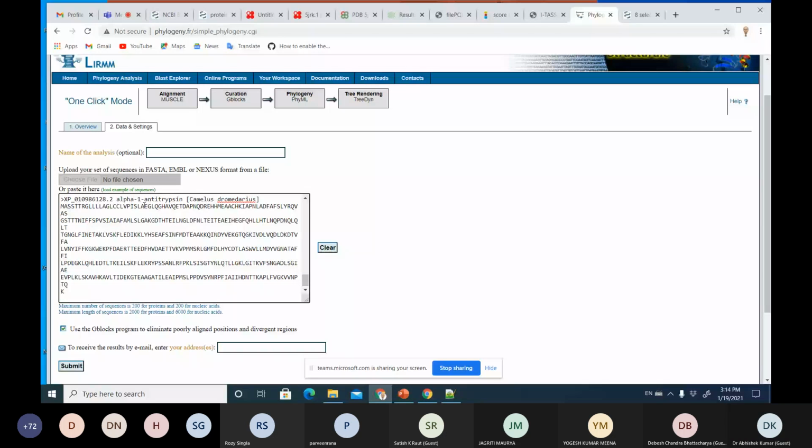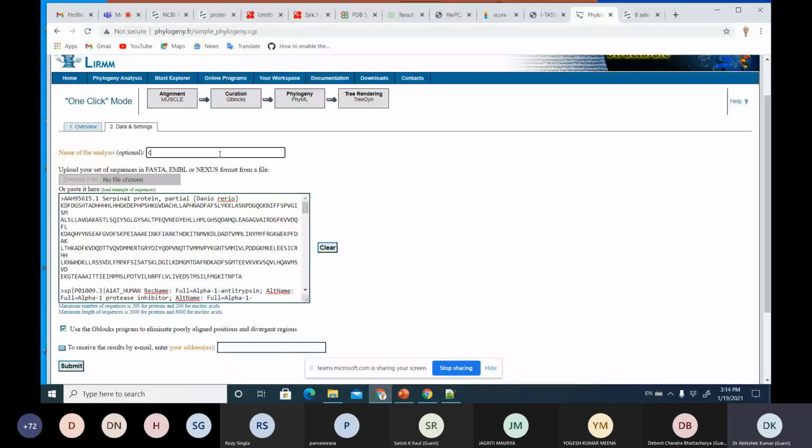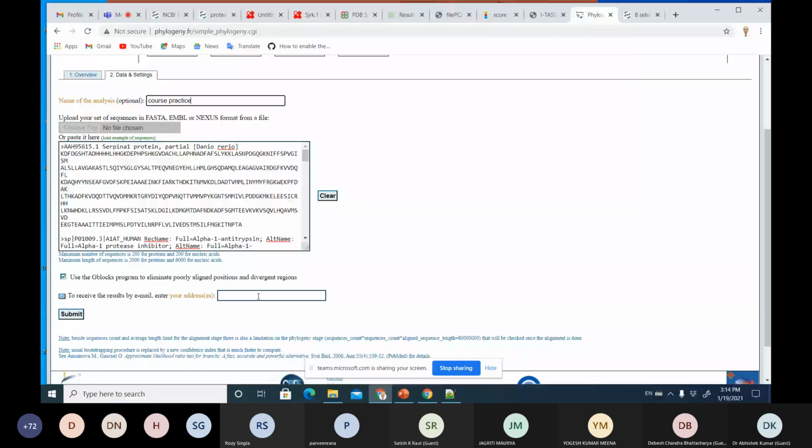I'm just saying course practice. Okay, and then it will ask for an email ID. And then I'm giving it an email ID. Matrix. Okay.